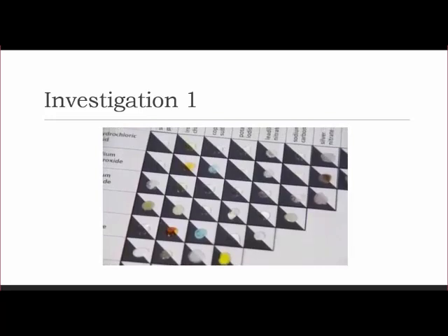So instead of doing this in test tubes where we would have to use a lot of each solution, we just use a few drops of each solution. And we use a sheet of paper covered with a sheet of plastic in order to observe the products of the reactions. Your data for this will depend on what you observe.